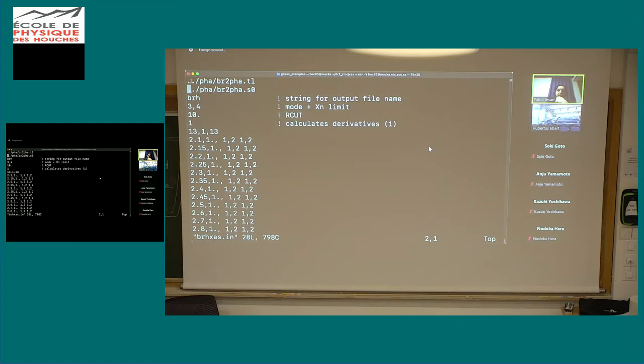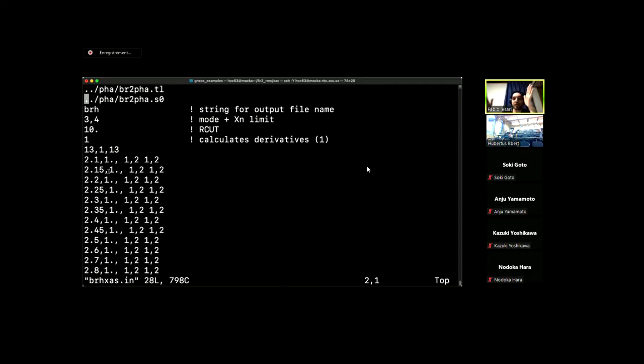So we want to calculate the two-body signal for many distances. This is because, as I said before, just to speed up the calculation, because it would be too slow to call GNXAS every time. Instead, we pre-calculate the signal for some distances, and then when we do the calculation, we interpolate the phase shifts and the amplitude on the correct distance in the module.